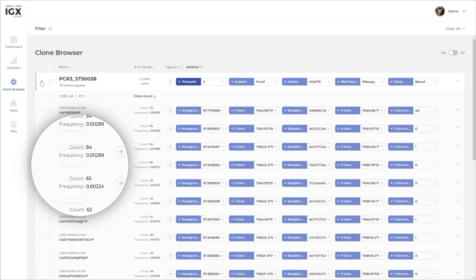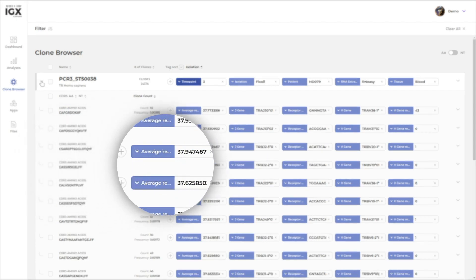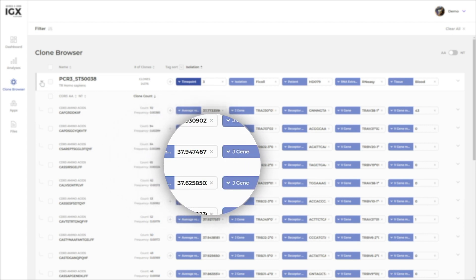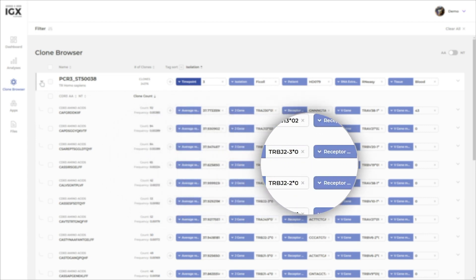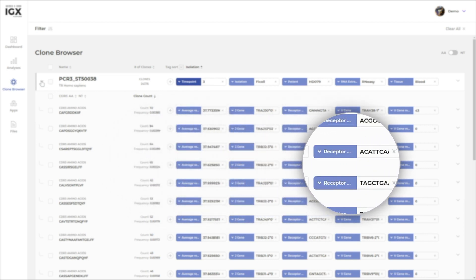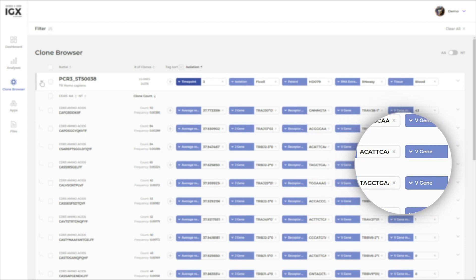Some annotations are added automatically, such as the CDR3 sequence, V, D, and J gene annotation, and the clone clonotype abundance.